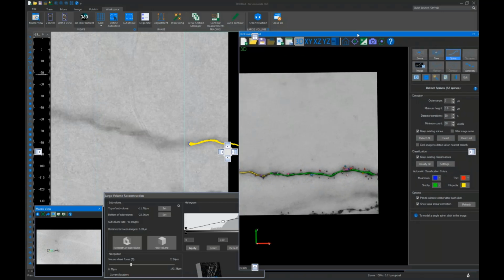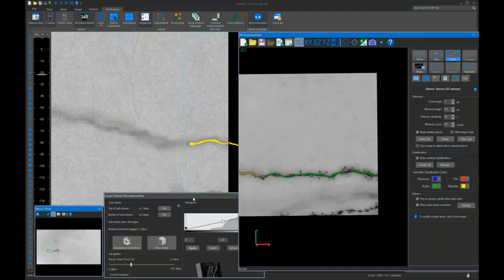So this image is a high resolution volume, and it's actually quite large, because it spans not only the apical dendrites, but to the soma, the basolateral dendrites, and inclusive of the entire axonal arbor for the dimensions of this image volume. And so this is quite a large volume.